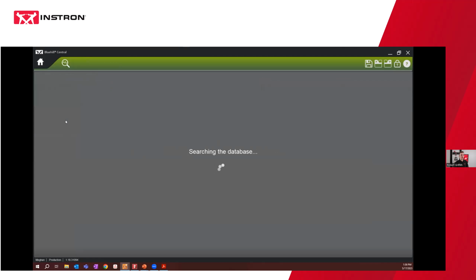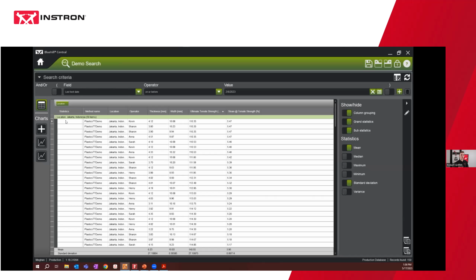What she can do is open this search that she's already created once and saved. And what it'll do is it'll run again and pull all of the information that meet the parameters that she's defined. The parameters up here are just test date. So this is looking for all tested specimens that were tested on or before the 8th of February, 2023. You can customize what this operator is, whether it's on, after, before, between 2 dates, if you wanted to look over a specific date range.